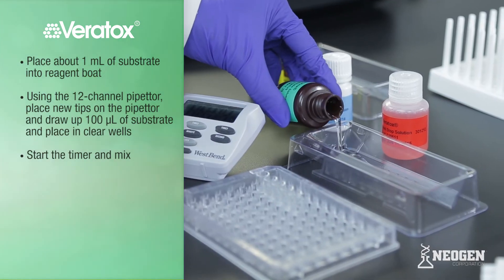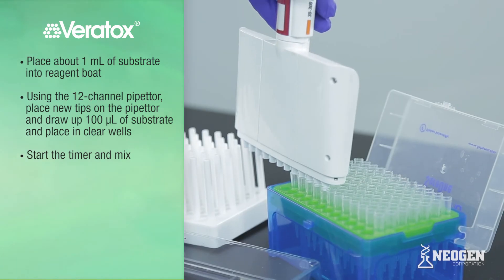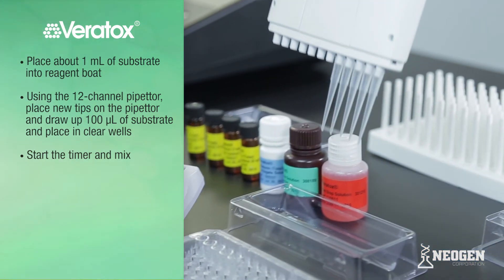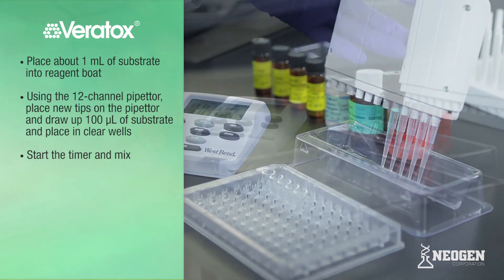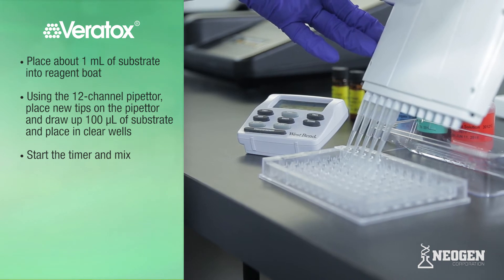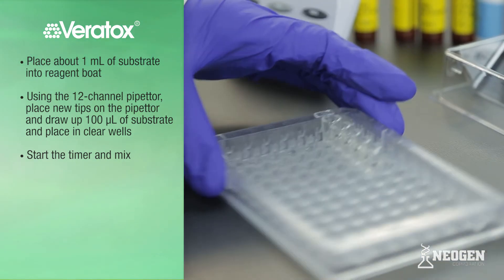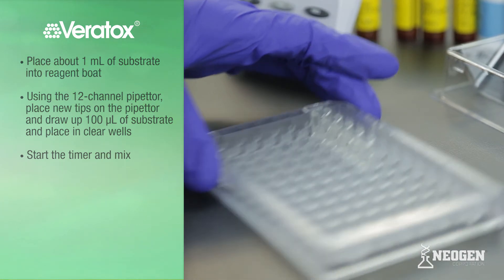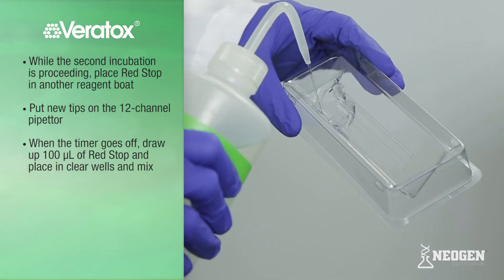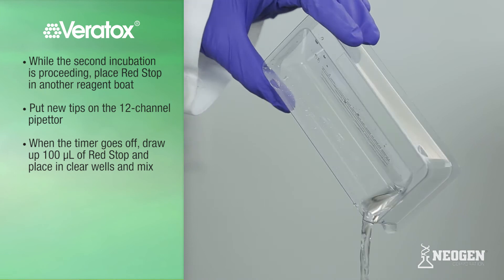Place a small amount of substrate into a reagent boat based on the number of wells. Using the 12-channel pipetter, place new tips on the pipetter and draw up 100 microliters of substrate and place in the clear wells. Start the timer for 3 minutes and mix by sliding back and forth for 20 seconds. Refer to the test kit insert for specific timing of other mycotoxin test kits. Discard any excess substrate from the reagent boat and rinse clean. Do not pour back into the substrate bottle.